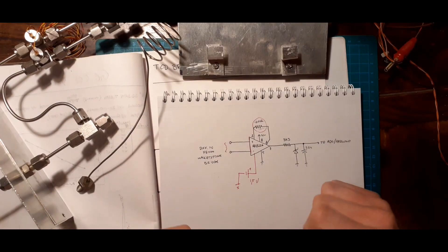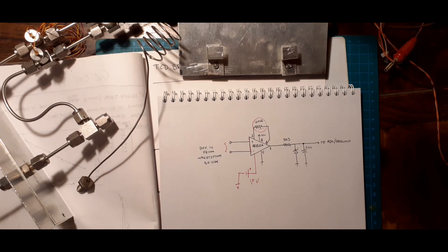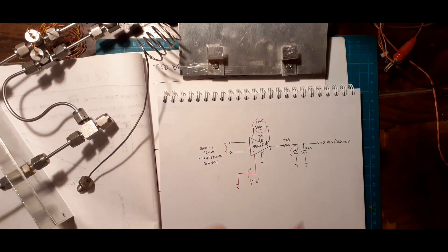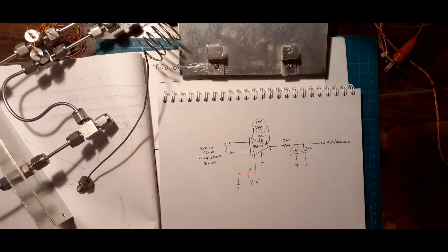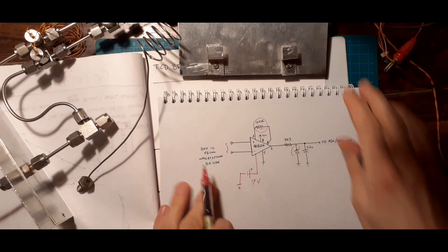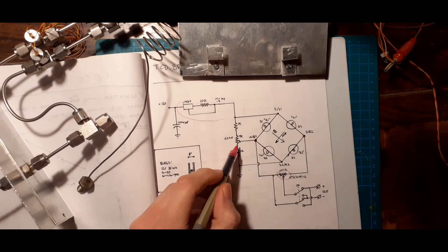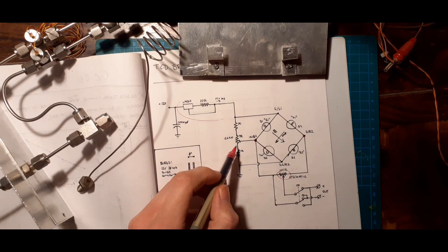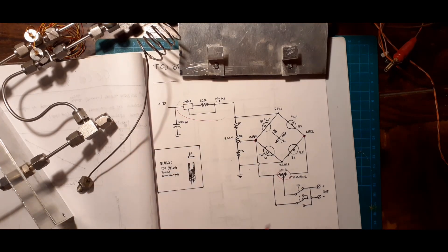And my reference voltage is just an AA battery soldered directly to it. I opted for this simply because it's the simplest solution, and it's a very stable DC source over the 15 to 20 minutes that a run on this thing takes. It's important to note that once you have a reference voltage that's not zero, when you zero out your bridge, you should not zero to zero volts, you should zero it to the reference voltage, because that will be the zero for the detector.